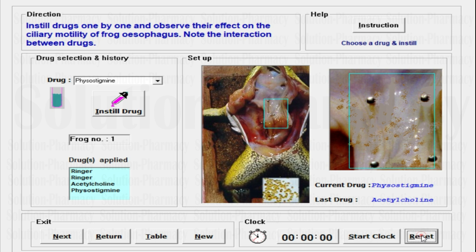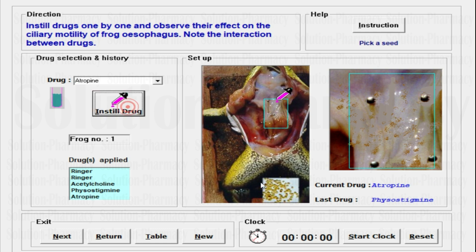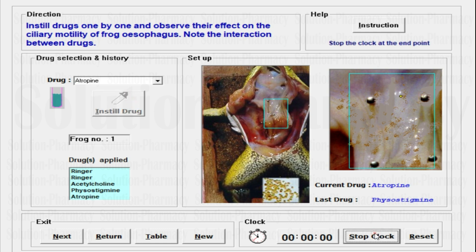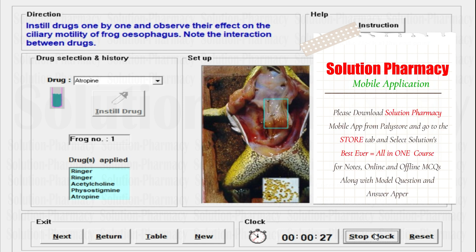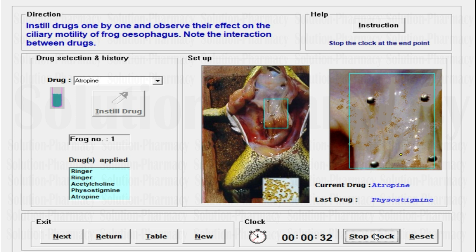Click the Reset button, then select the last drug, atropine. Instill the drug, click on the seed, drag it toward the starting point, release it, start the clock button, and note the time required for the seed to fall from the starting point to the end point. I hope you have noted all readings so you can calculate which drug has more effect on the ciliary movement of the frog esophagus. It is taking a larger time than physostigmine's 19 seconds — now it is 40 seconds. The effect may vary slightly when you apply the drug in the simulation software. Atropine has low efficacy toward ciliary movement on the frog esophagus, slowing down the motility.